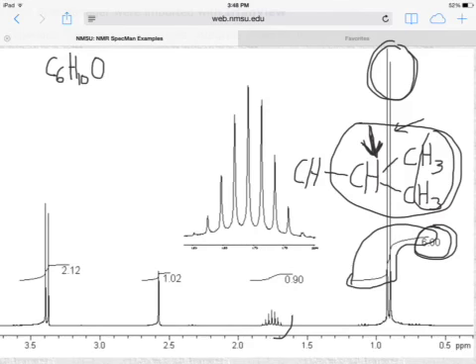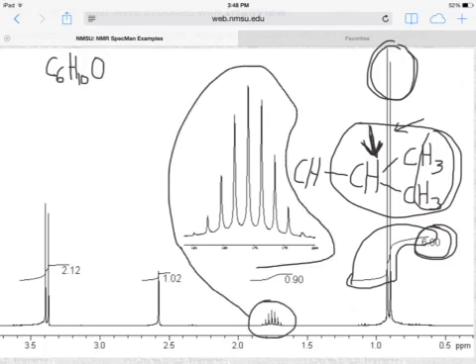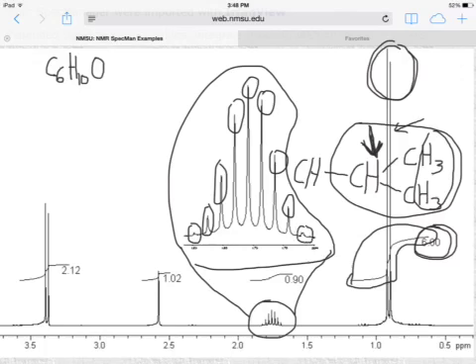They have blown up this signal here, so we can see in great detail each of these little peaks, and it looks like there's 9 of them. We got the tiny little thing over here, 1, 2, 3, 4, 5, 6, 7, 8, and the tiny thing over here makes 9. So this hydrogen must have 8 hydrogen neighbors within 3 bonds.